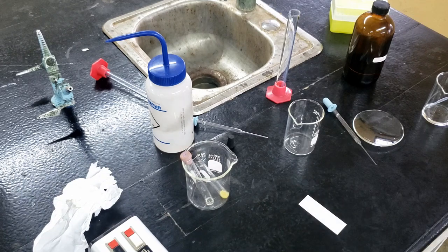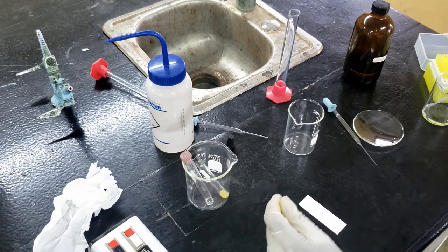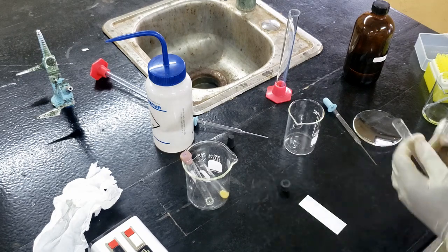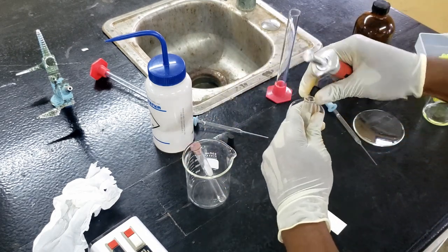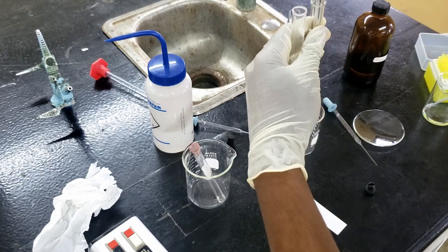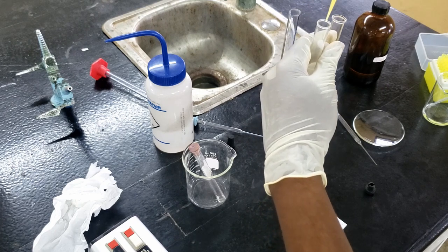And then for the O, I'll get a micropipette. On a clean tube, I'm going to micropipette about 200 microliters of the oil. So that's 200 microliters.